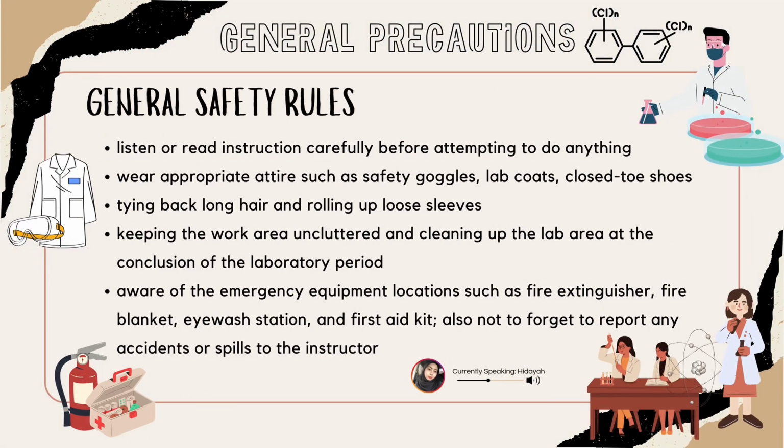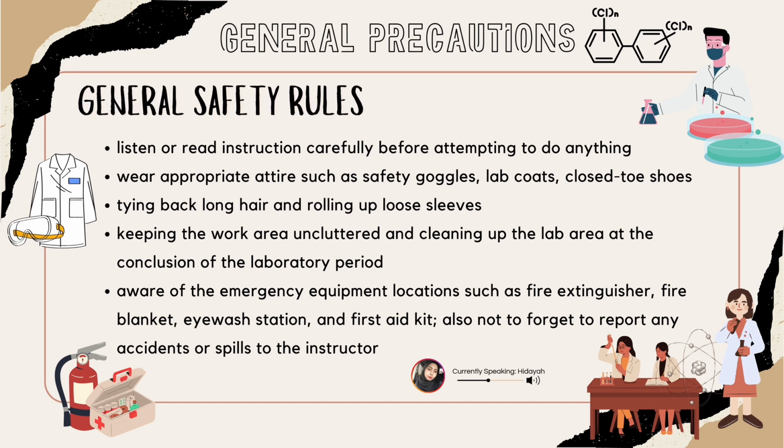For the general safety rules, first and foremost, always listen to or read instructions carefully before attempting to do anything. Wearing appropriate attire is crucial. This includes safety goggles, lab coats, and closed-toe shoes. Make sure to tie back long hair and roll up loose sleeves to avoid any hazards.